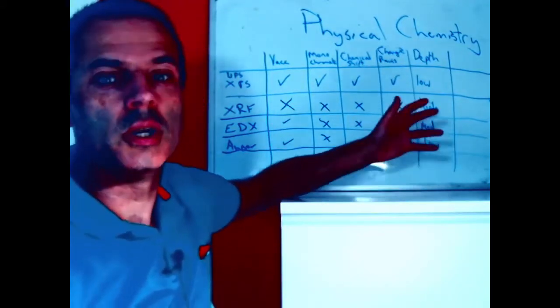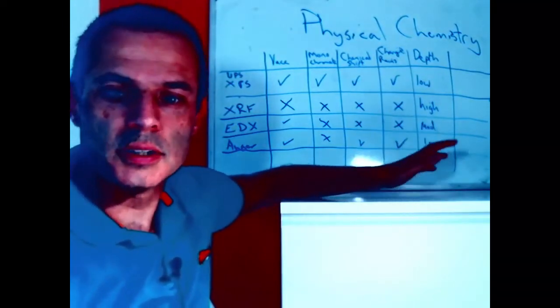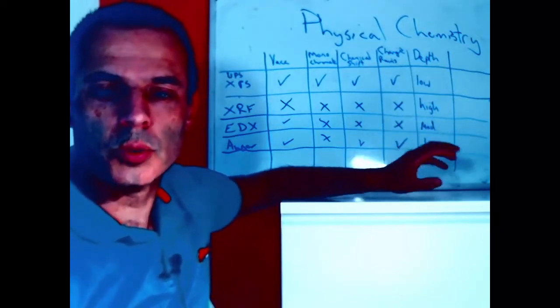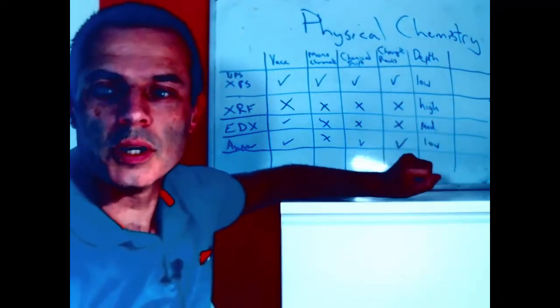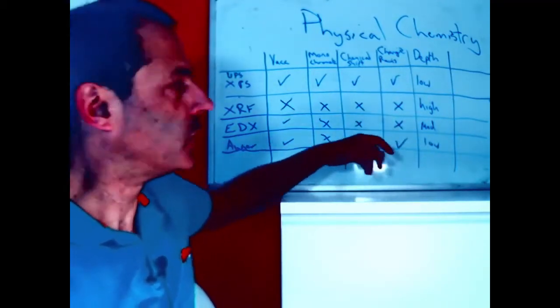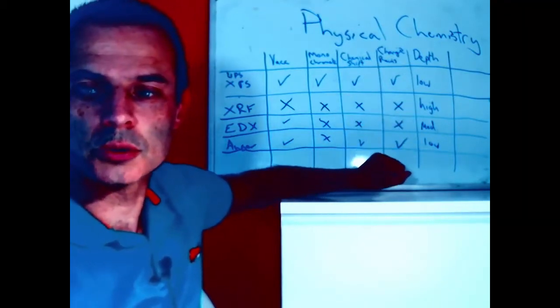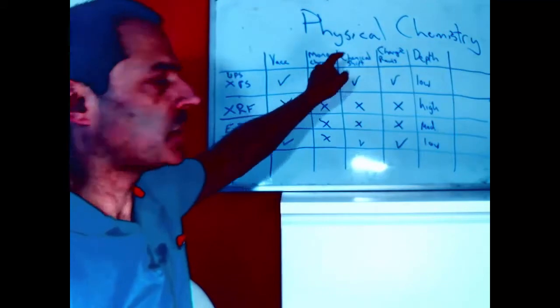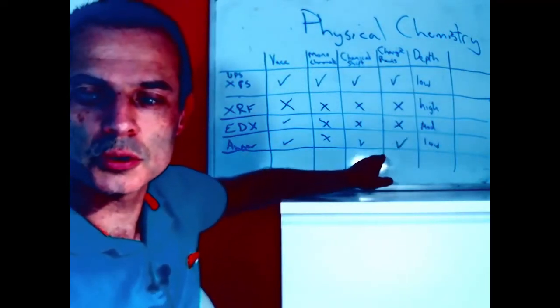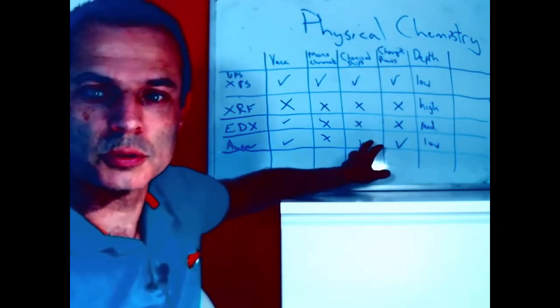If we've got carbon, oxygen, and calcium in there, is it calcium carbonate or is it something organic with some calcium in? We don't know. If we do X-ray fluorescence, it just tells us what the elements are. If we do EDX, it just tells us what the elements are, because it doesn't give us chemical shift information. XPS will tell us, but it's a lot harder. So the flip side of having chemical shift information is it's a lot harder to discover unknowns because our peaks move around.